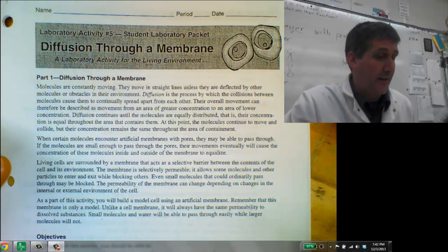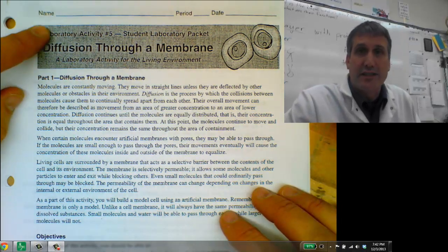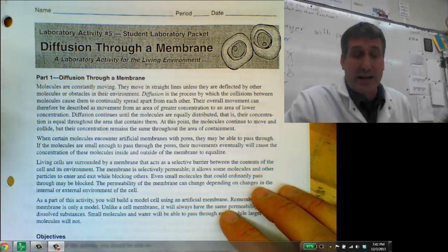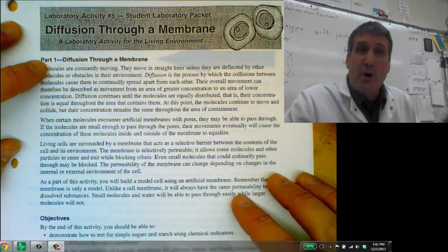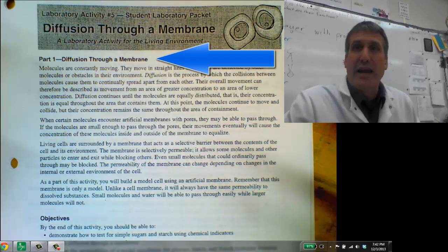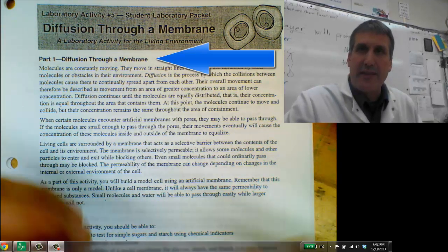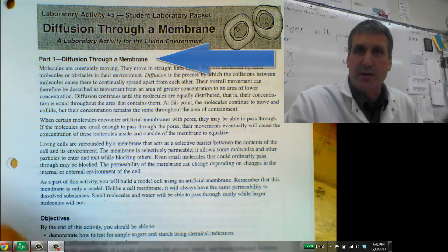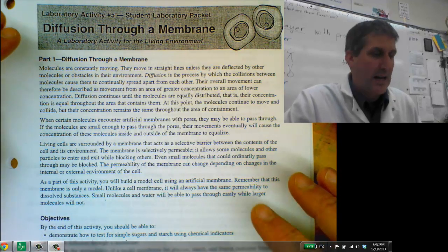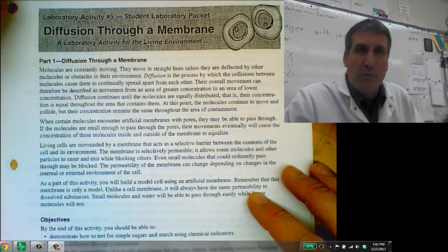Hello and welcome aboard the Biotrain. In this video we're going to talk about the New York State Diffusion Through a Membrane Lab. We're going to talk about part one where we're going to build a model cell and create a bunch of different concentration gradients and then see which molecules are able to diffuse across the cell membrane and which ones maybe won't be able to.